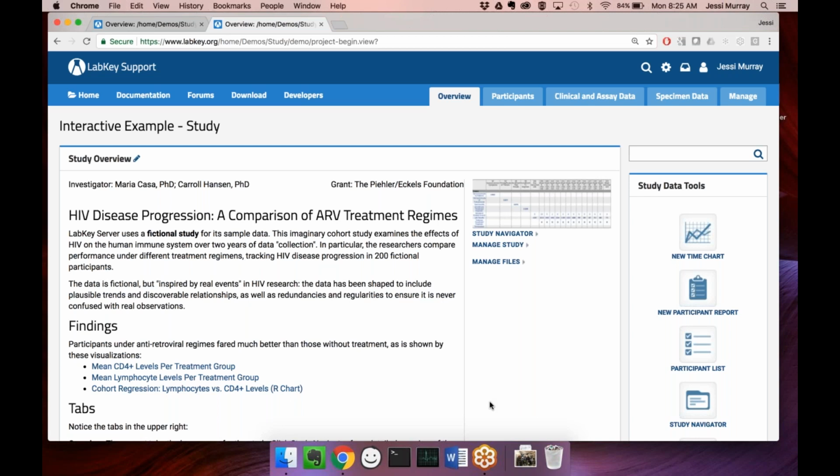That's been really helpful for us as we have rolled out the experimental features and now the existing V1 of the redesign. If those are as descriptive as possible, that's really helpful for us. And we love screenshots as long as they are not including any of your private data. Yes, definitely.